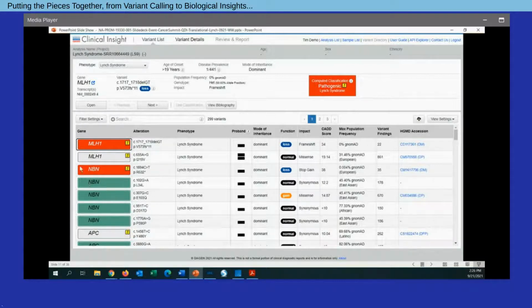So within this table itself, which will be a result for a sample analysis, we can see here that the MLH1 gene and the NBN gene in particular are red. That denotes a classification of pathogenicity, whereas we might see other variants that are white, that are of unknown significance, and then green, perhaps benign. Now, for each variant, we'll also have a table of annotation. And very nicely within this table, since we're looking at germline data, we would be able to see whether any of these variants are observed within the HGMD database as well.